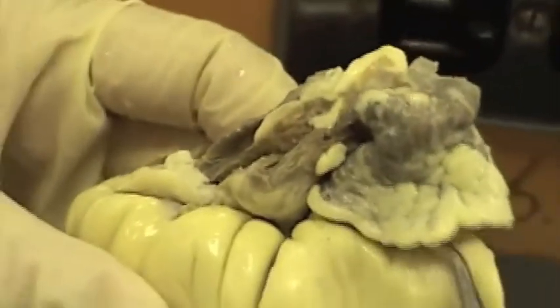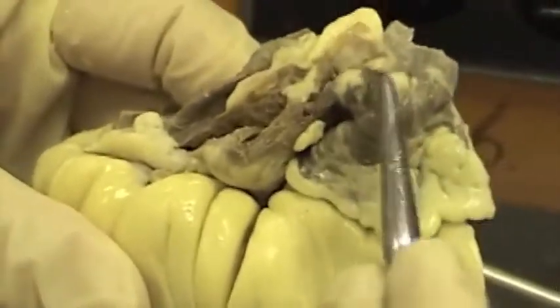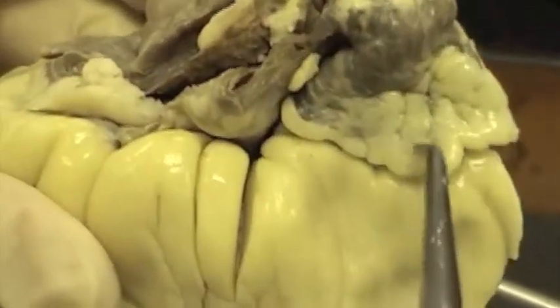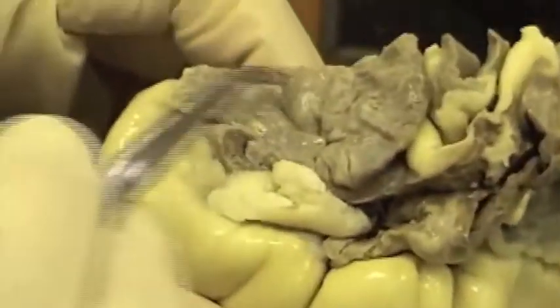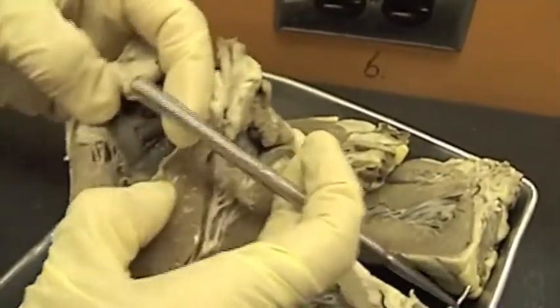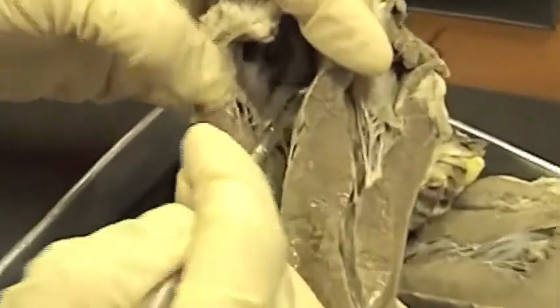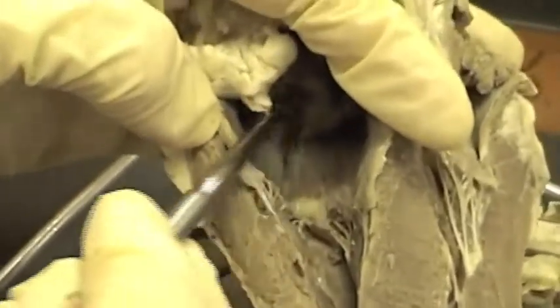Here we have the auricle of the atrium. The atrium is underneath, associated with this auricle flap — that would be the right one, and here would be the left one. Again, here we have the right ventricle, the tricuspid valve, and above that would be the right atrium.